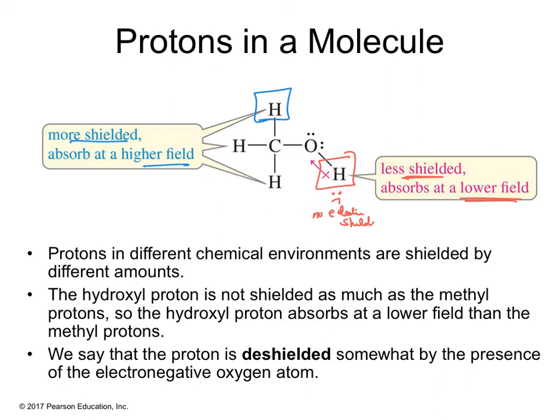And the lower field, it's always been reversed. I can't stand the higher lower thing. Basically this OH will probably show up around 4 ppm. You see how that's a higher number than this one here, which will show up around, let's see, 1, 2, 3, maybe 2.5 ppm. ppm is parts per million, and that is the units.